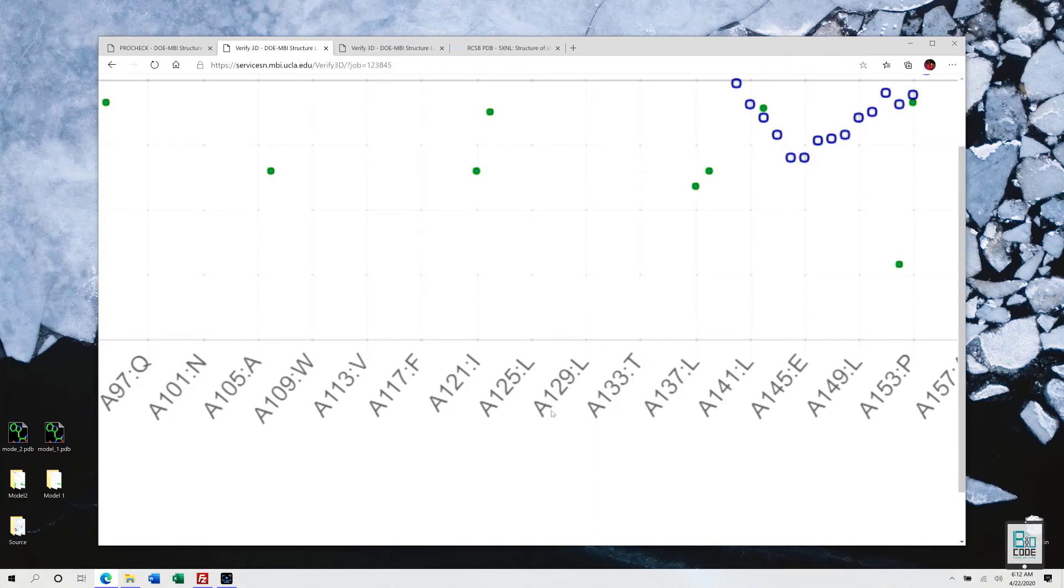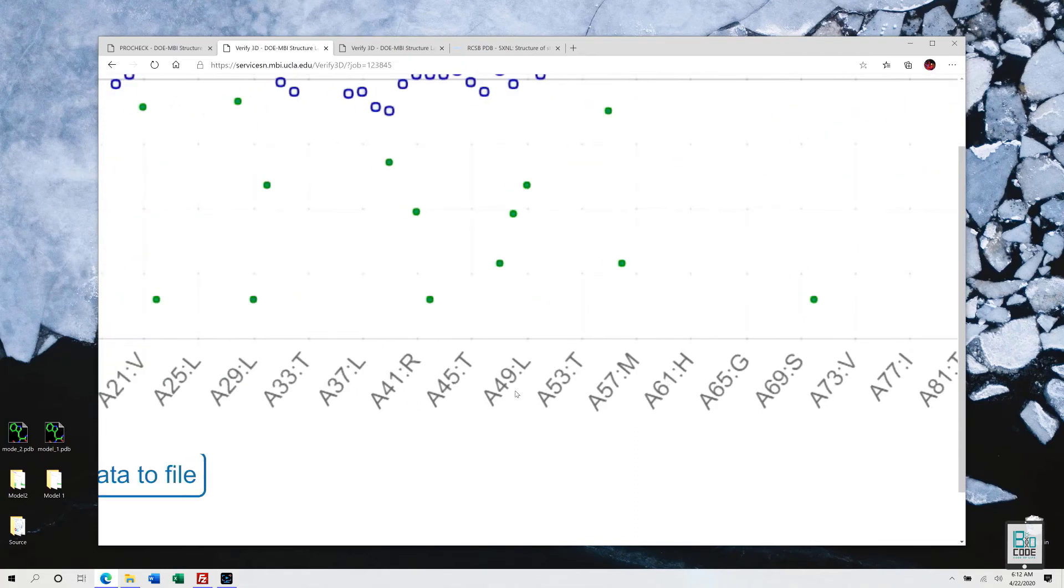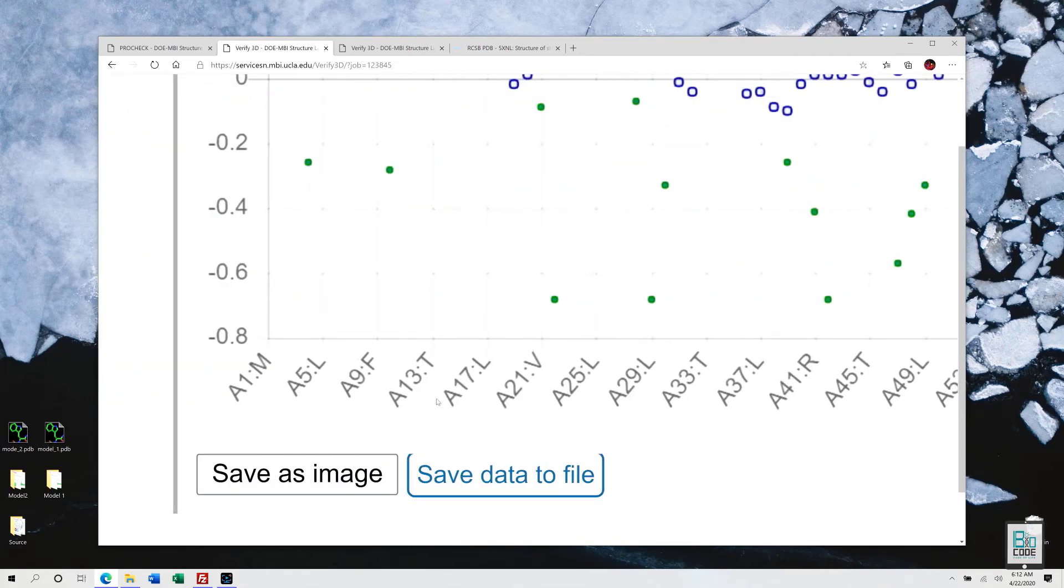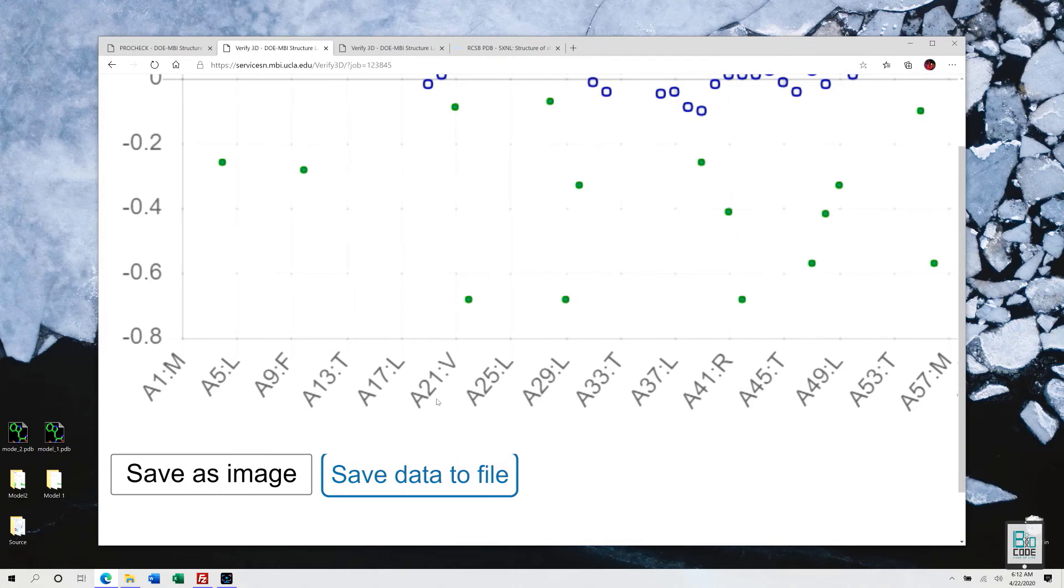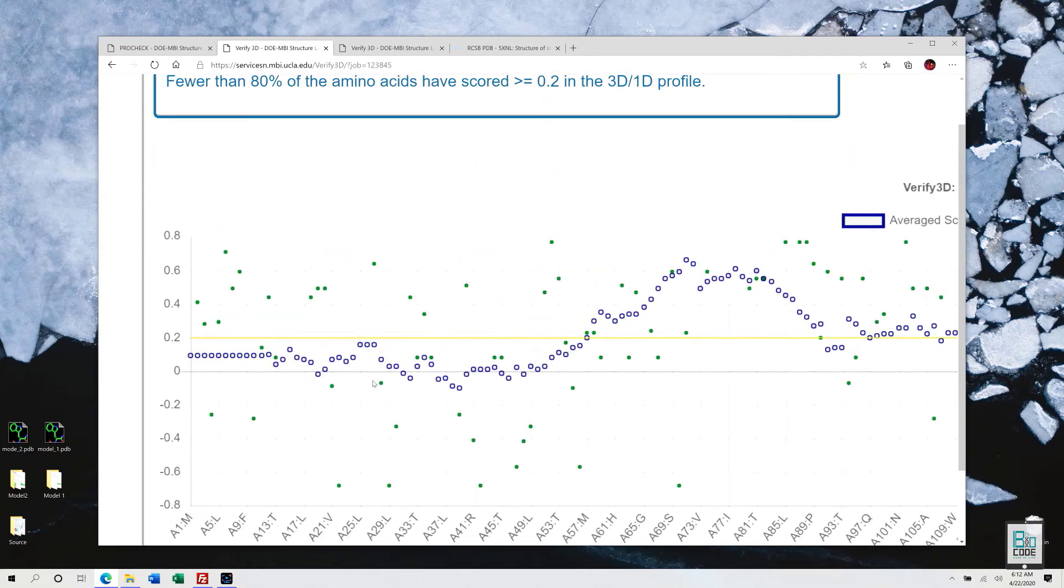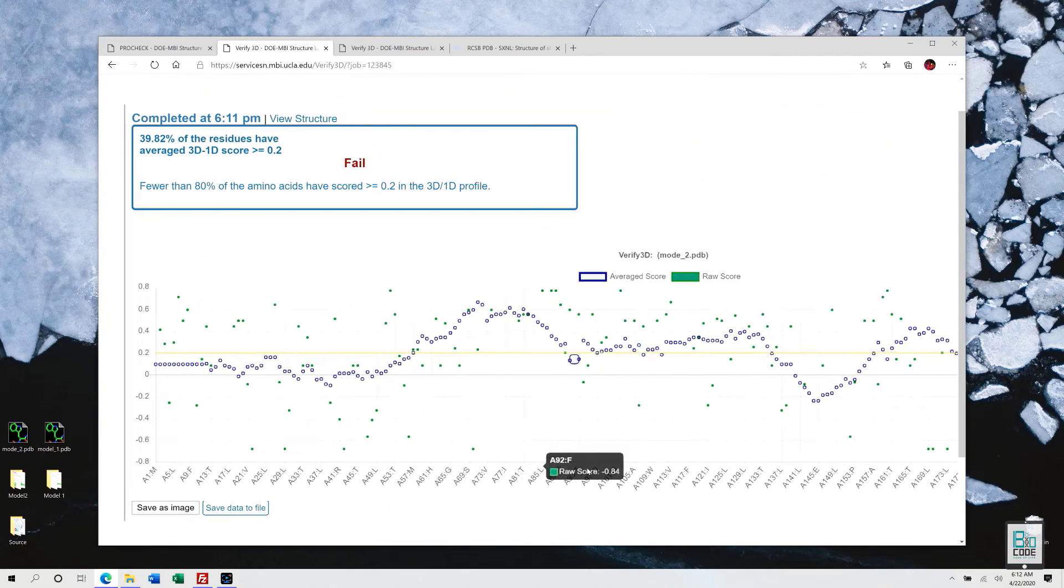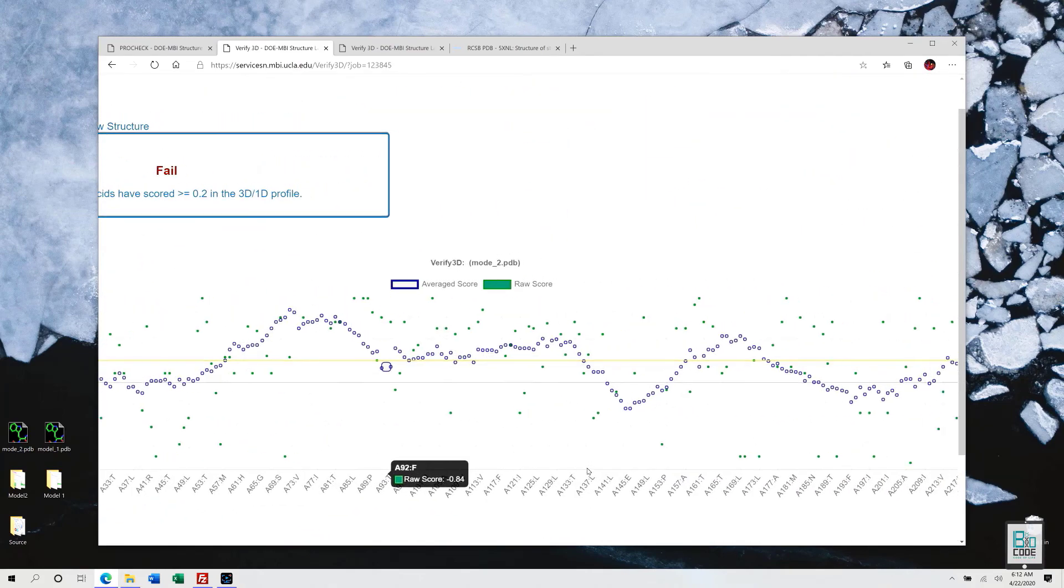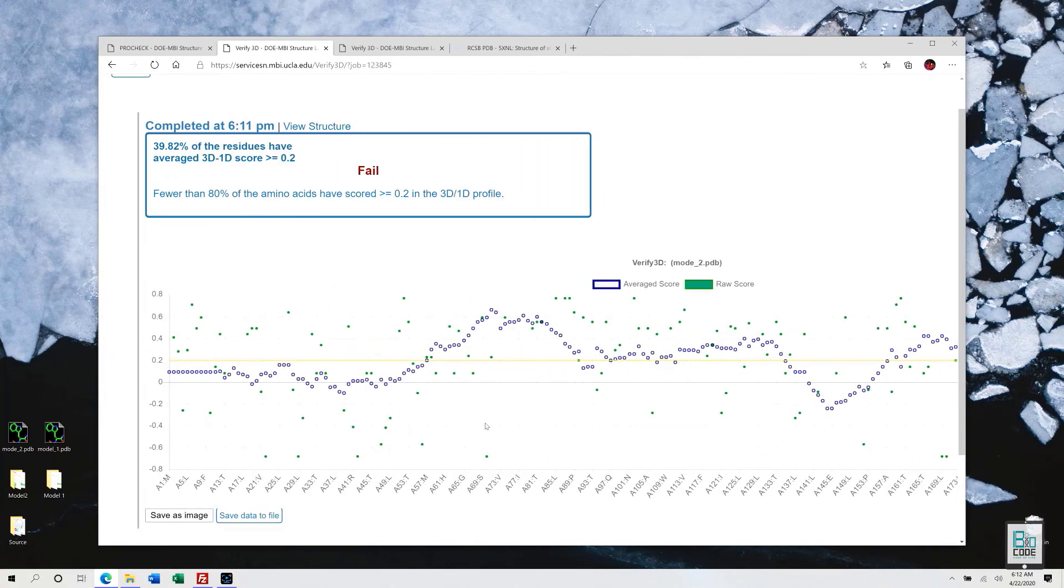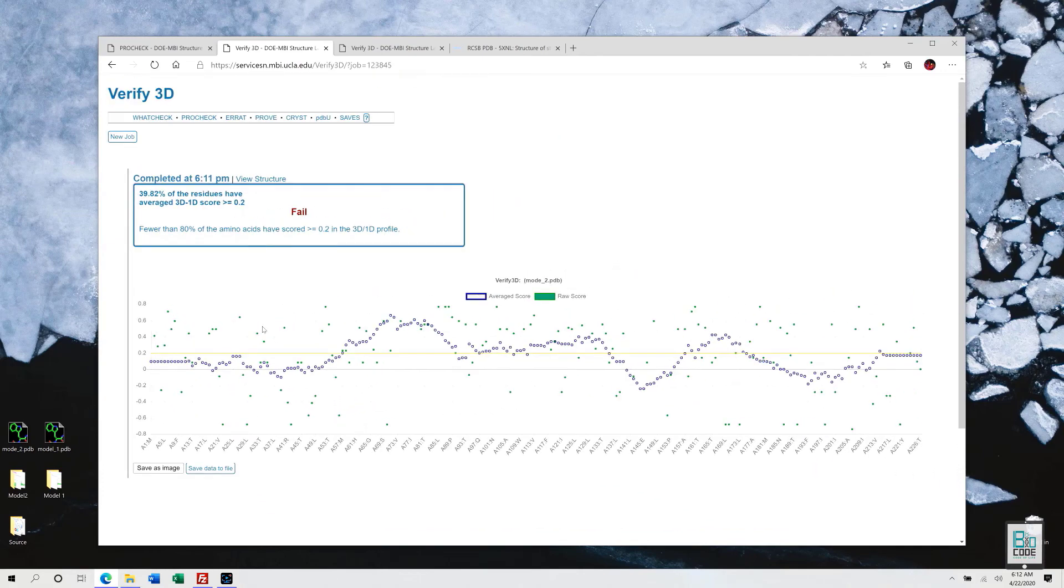At the bottom, our residues are present, and then A-A means the chain. We only have a single chain, so it is an A chain, and 129, 121, 125 are the protein residue numbering indexes. For example, it starts from methionine, and then at the fifth position we have L residue, then F, then T, and so on. Likewise, the entire protein sequence is present at the bottom on the x-axis, and the y-axis we have the score.